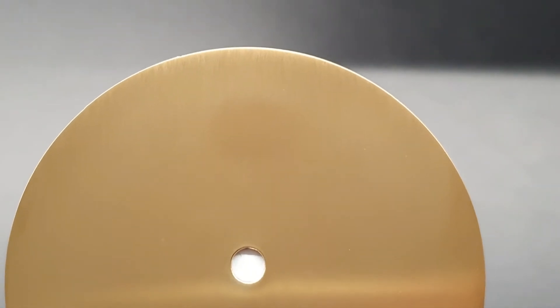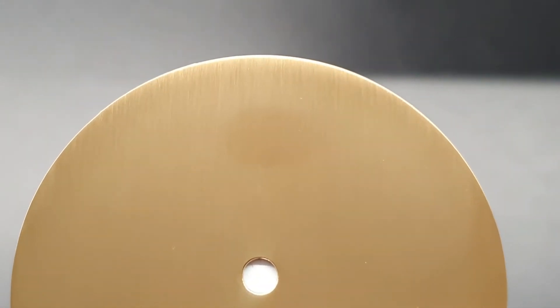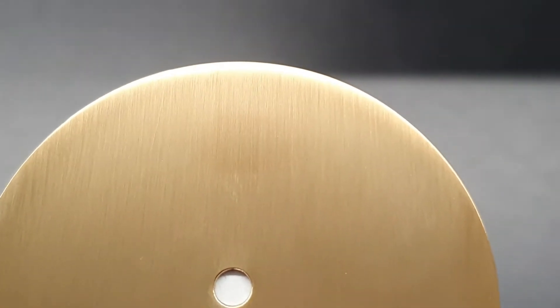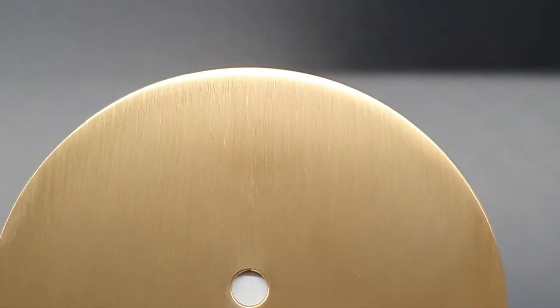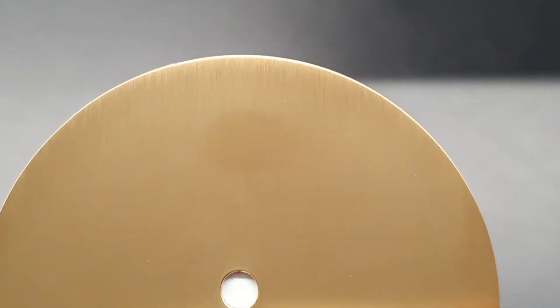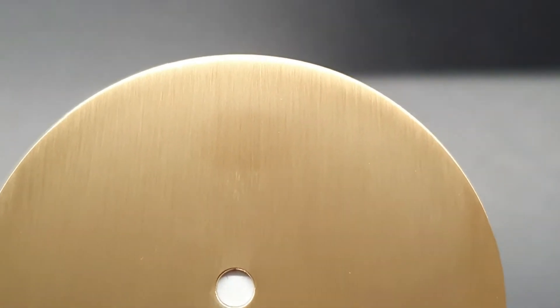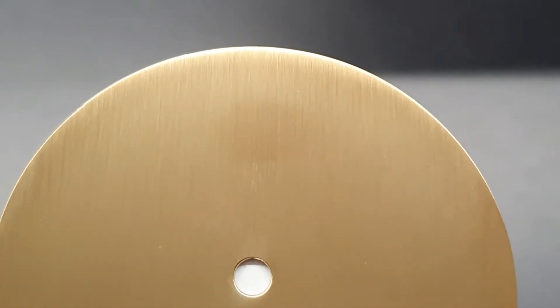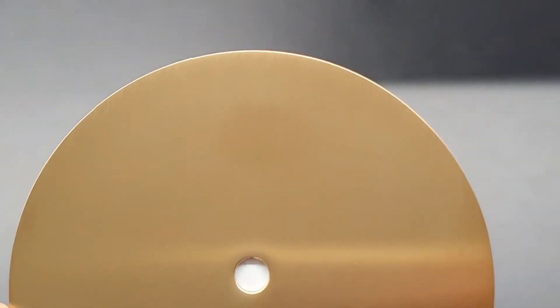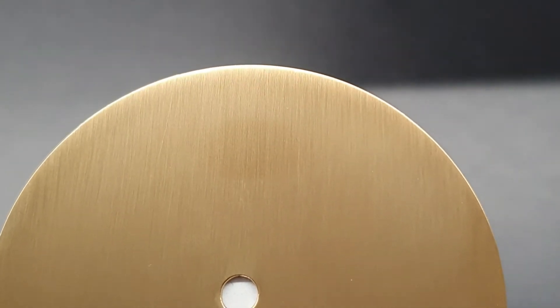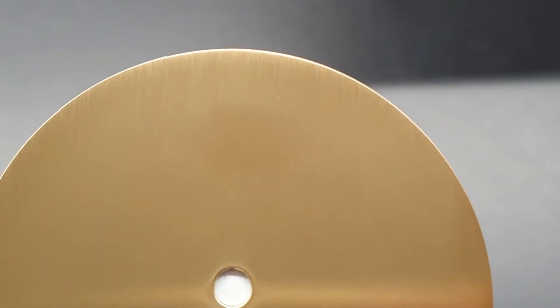This is the gold PVD coating on the brushed surface. You can see something like a shadow on the surface depending on the angle of the light. It's not glossy or something, but it's like a shadow on the probe itself.